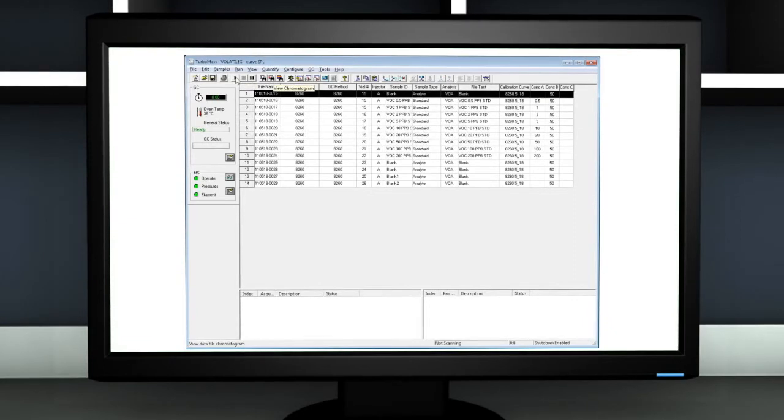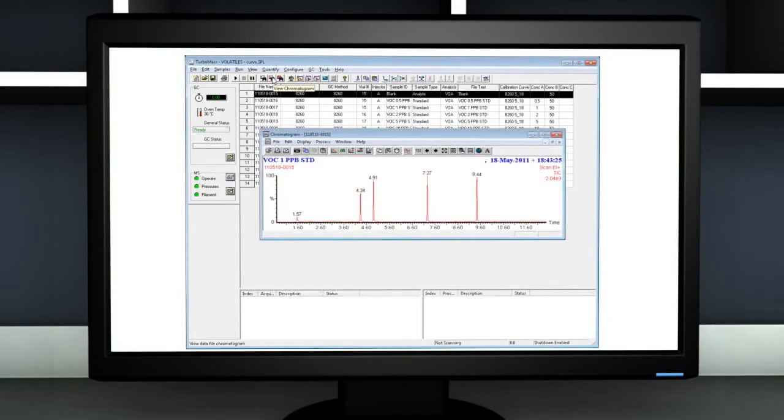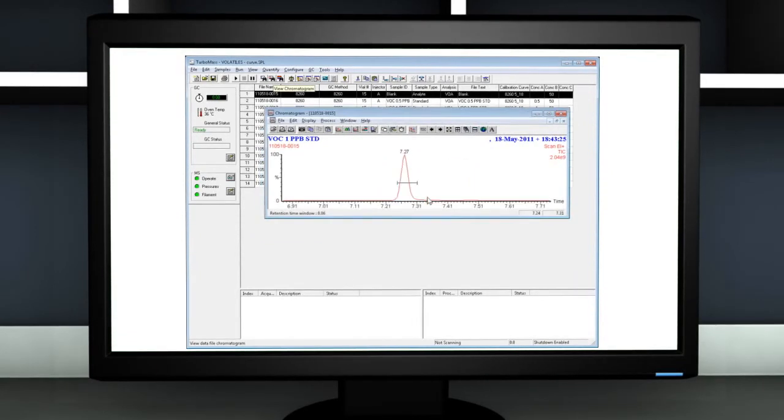A chromatogram can then be displayed by clicking on the Show Chromatogram button and individual peaks can be selected to show specific spectra.